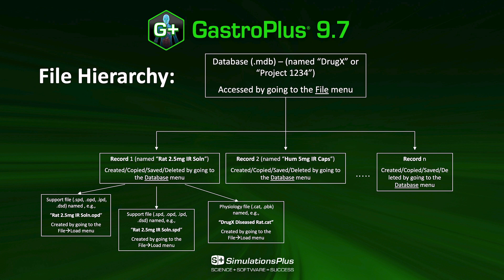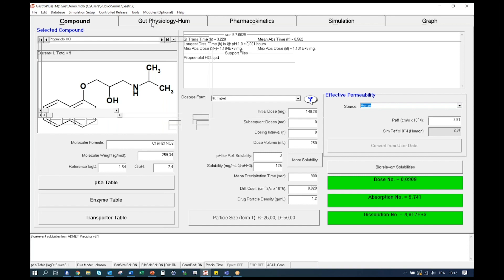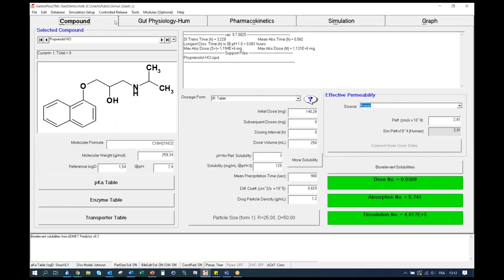Now let's have a look at the GastroPlus user interface. Here on the screen, you can see the GastroPlus user interface. It is divided into five tabs at the bottom that are accessible by simply clicking on them. These five tabs are: compound, gut physiology, pharmacokinetics, simulation, and graph. In the remaining of this video, we will go through each individual tab and present them.